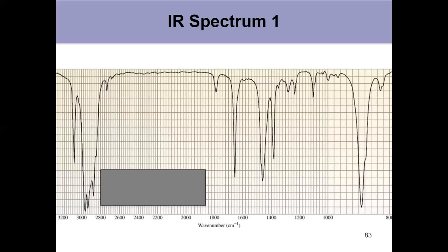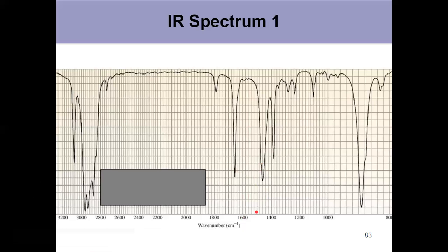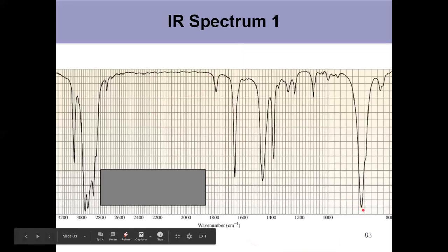Okay. Now with sp2 hybridized carbons, if those were corresponding to benzene, I would also see peaks at around 1600 and 1450. Okay. And I don't see anything at 1600. I do have 1450, right? But you have to have both of them together. Even if these were our 2 peaks, they'd be a little more intense. So no benzene. Okay. So really, all of my information is coming from here, plus the absence of peaks over there. No alcohol shown over here, no carbonyl shown over here. Right? So really no other functional groups to worry about, no amine, no aldehyde. And if you want to check your fingerprint region, this 890 tells you you've got a terminal alkene.